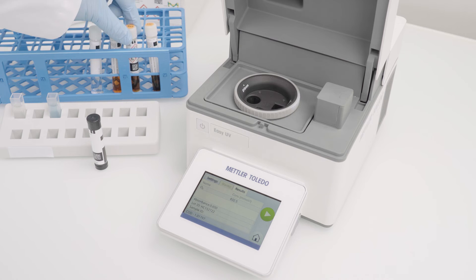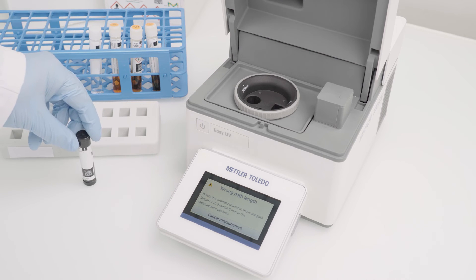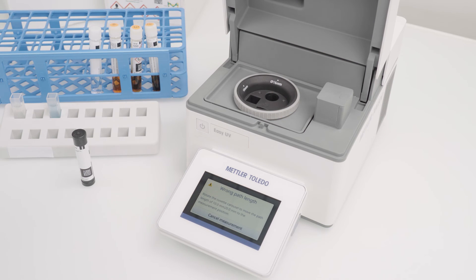For reagent test kits, the barcode on the auto selector can be scanned. The instrument checks the allowed path length and informs which ones are allowed. By moving the X-Path holder into the correct position, the pop-up will disappear.